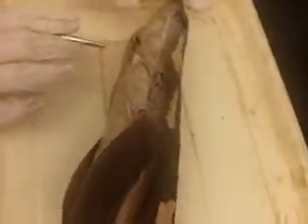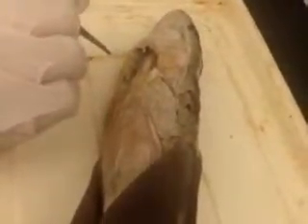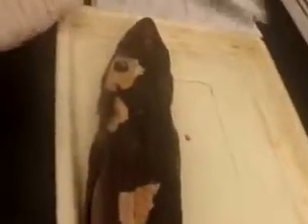The next one is the levator hyoidus, and the levator hyoidus is right here. Which is, actually, hold on a second. No, it's not. I made a mistake there. Levator hyoidus. Is that the same? I don't think it's listed on.